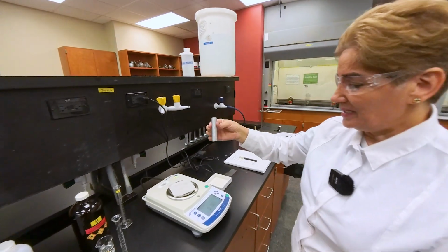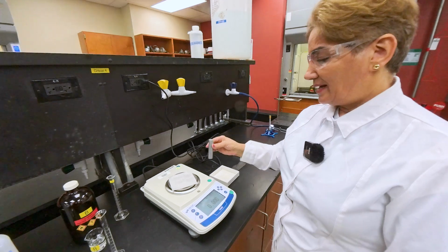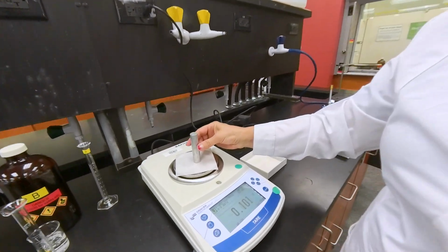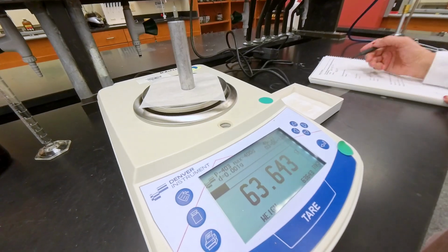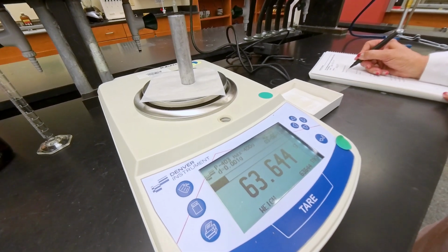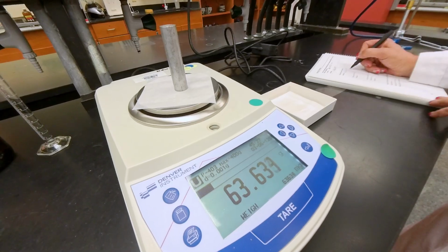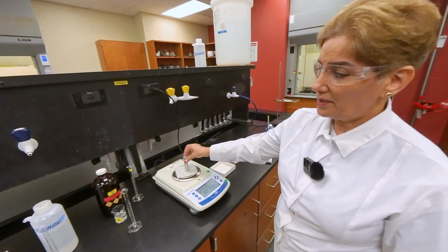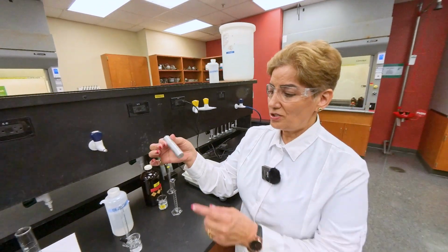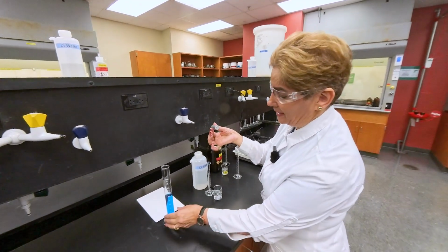That part is easy, and I will measure the mass first. Make sure the scale is tared, and I place the object on the scale, record the number, and this is in grams. We record that number for the mass of the cylinder. Then we are going to measure the volume by displacement, just like the pieces of the zinc.